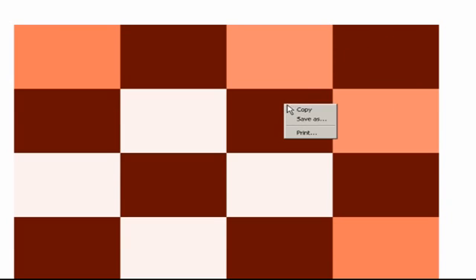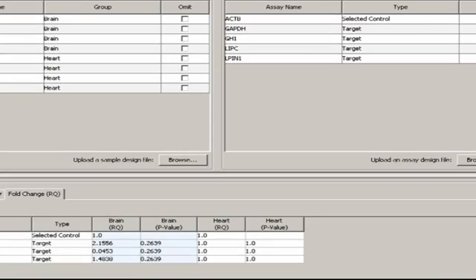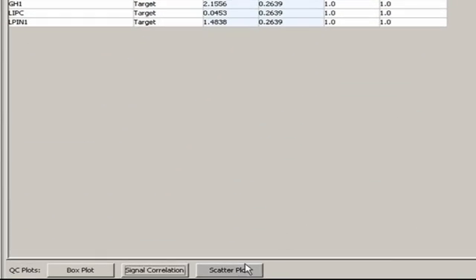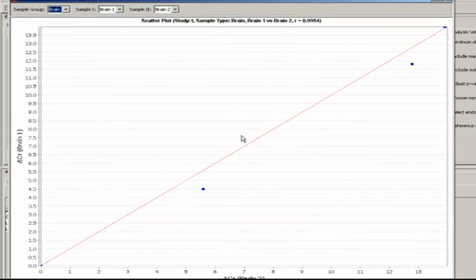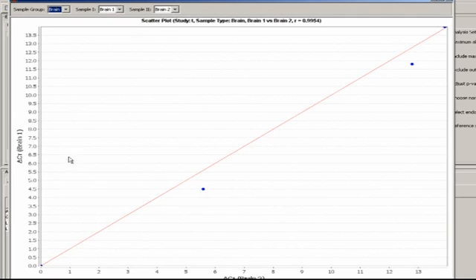As with all plots in DataAssist, users can right-click on the graph and save it as an image file, or as a JPEG, or print it. Scatter plots allow you to select any two samples within a single group, or if no groups are assigned, any two individual samples. You can then see how the two samples' delta CTs correlate, generally speaking, across all genes.